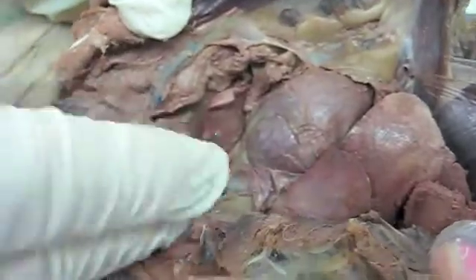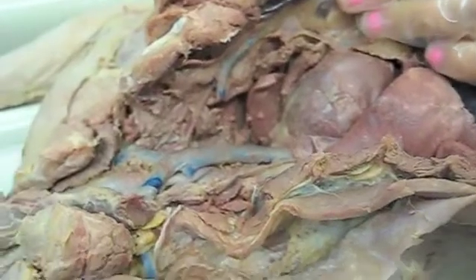Typically, we cut out the thymus gland because it's lying in here just anterior to the heart, and when we start uncovering all of these blood vessels, it disappears, really. So you're saying no function. Well, the thing is, the thymus gland is very prominent in younger cats, but then in older cats, the tissue begins to degrade, and we have a lot of fatty tissue in that area and so on.